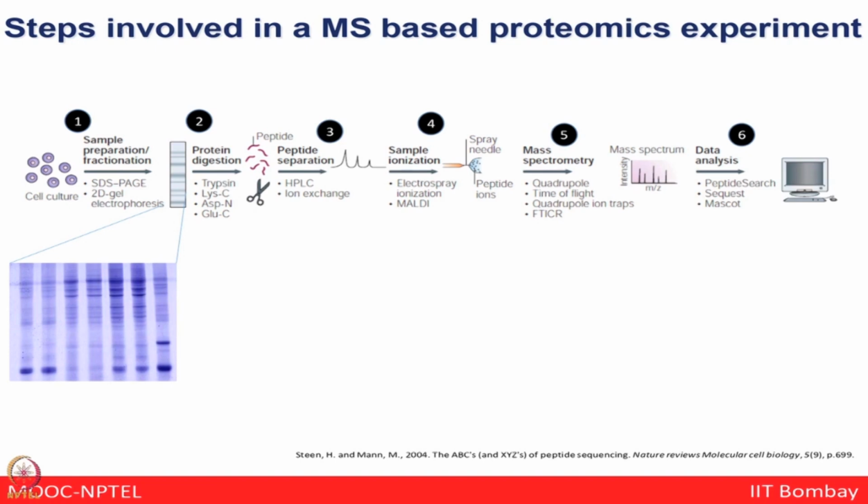You can separate the complex proteome on the gels to first ensure that the protein profile looks good, the lysate looks good, and then either you can cut the entire lane of these proteins from the gels, excise all the bands for the in gel digestion, or go back to the lysate and do the direct in solution digestion of this protein. The goal here is to convert the complex proteins to the simplified peptide forms.